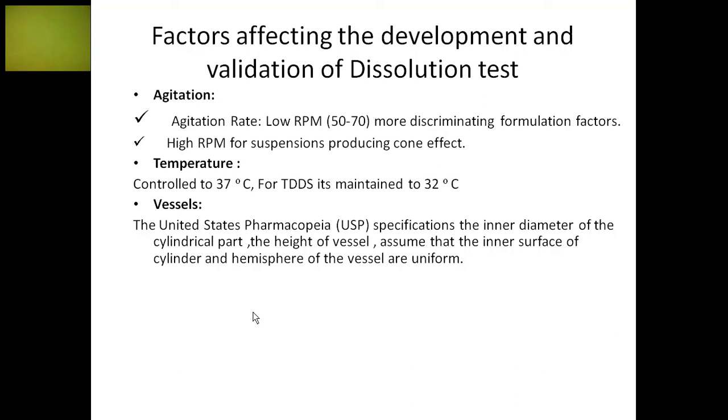Now next is the position of the tablet in the vessel. That is very, very essential. As I told you in the first point, if the tablet is at the bottom, it experiences less effect of the hydrodynamics, so there will be relatively less dissolution.